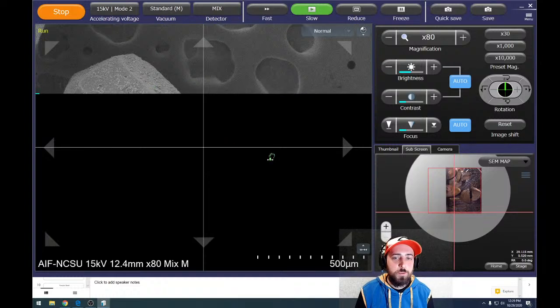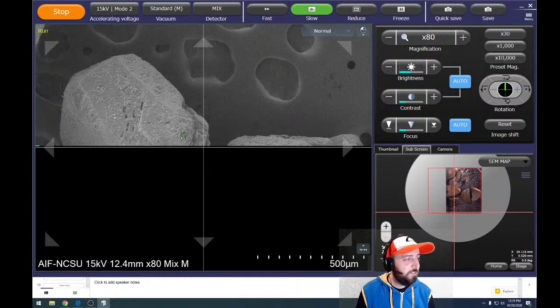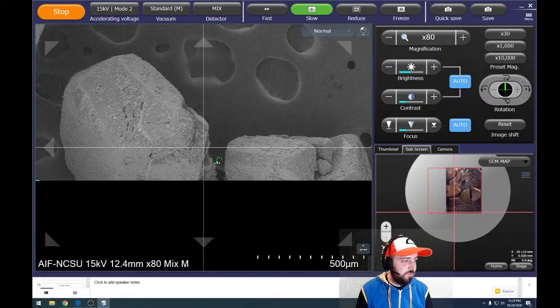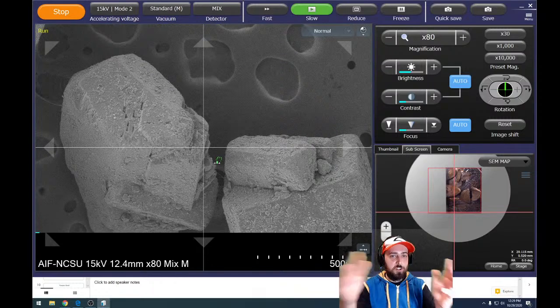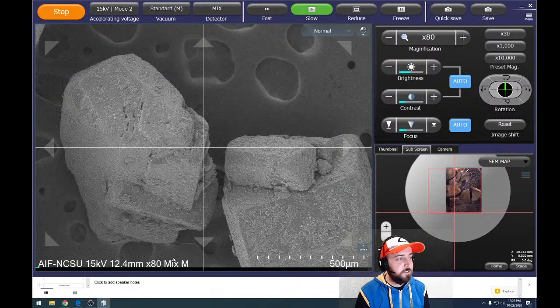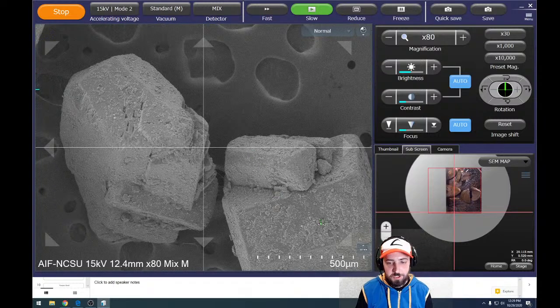And we are seeing only about 2 grains of that sugar. A little bit of that is my fault because I didn't have as much of this sugar, but still, imagine if the screen was full of particles at the same magnification. We're only seeing two in what we call our field of view right now, which is the whole area. So the turbinado crystals are much larger, and there's a lot more refinement to get that sugar into smaller crystals with less impurities.